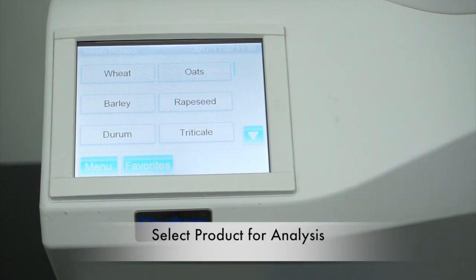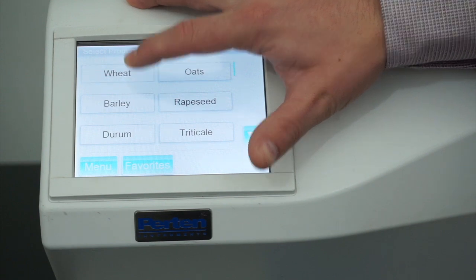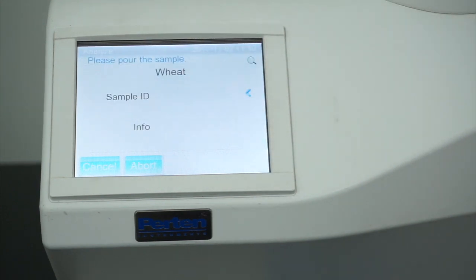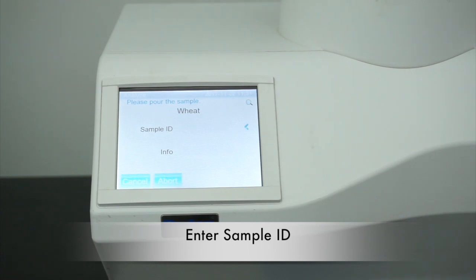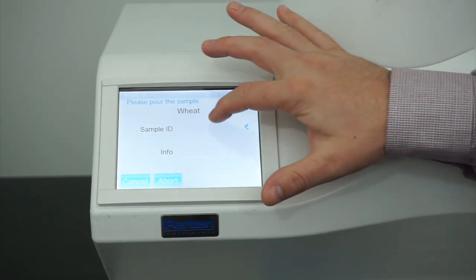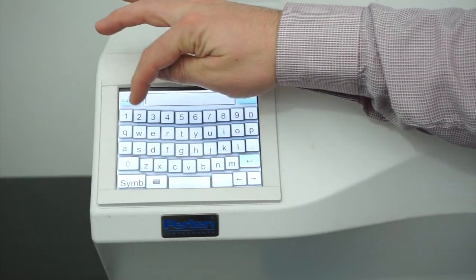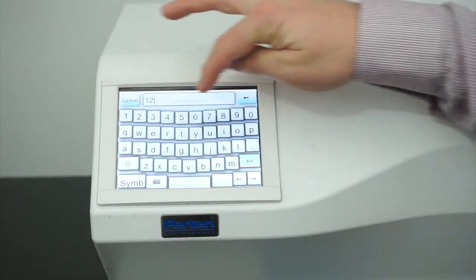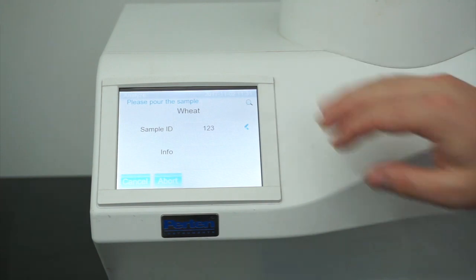To run a sample on the Aquamatic 5200, start by selecting the product by pressing the corresponding button. You will then be given the opportunity to enter a sample ID and any other further information you may wish to enter.